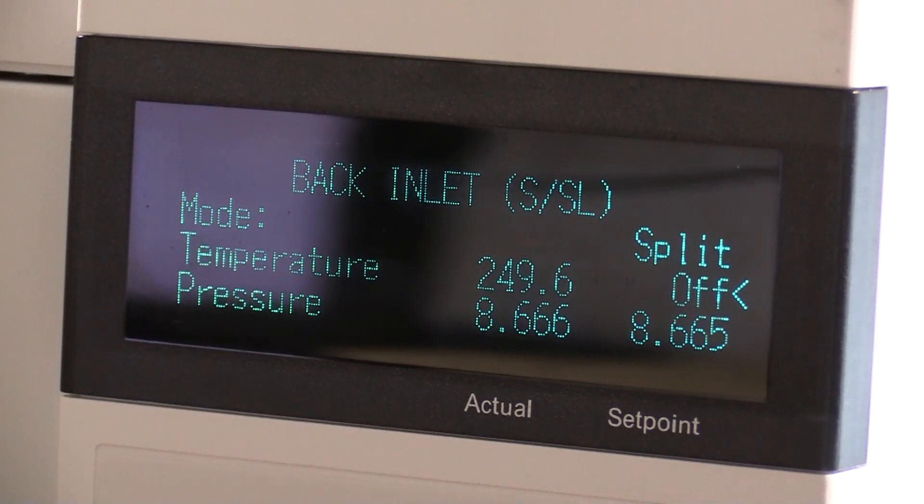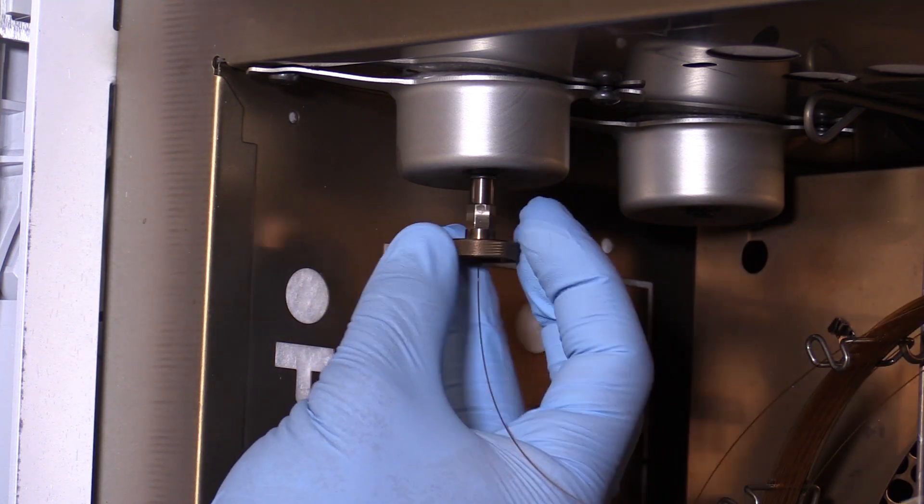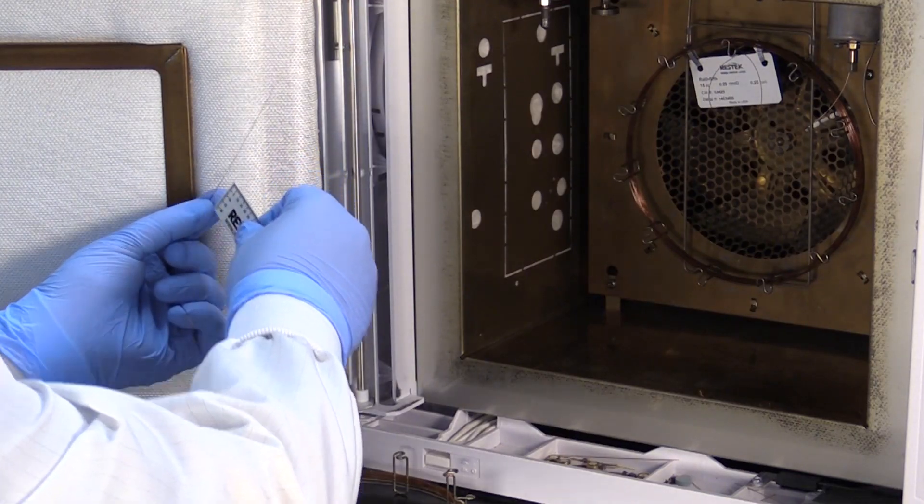First we'll cool our inlet and oven as well as turn off the instrument flow. Once these have cooled we'll uninstall the inlet end of our column and trim it if needed.